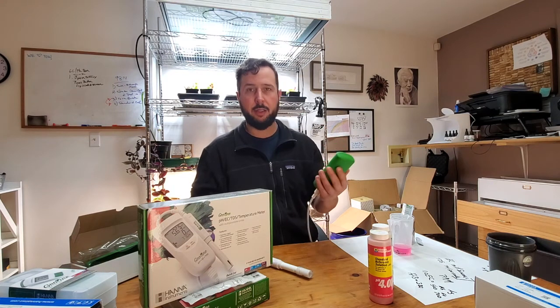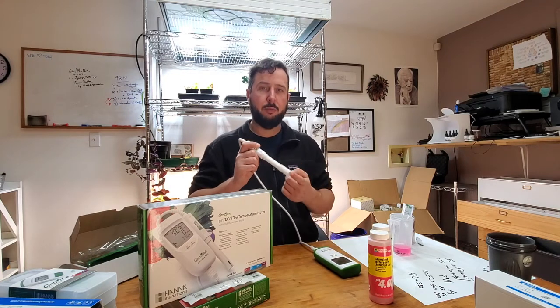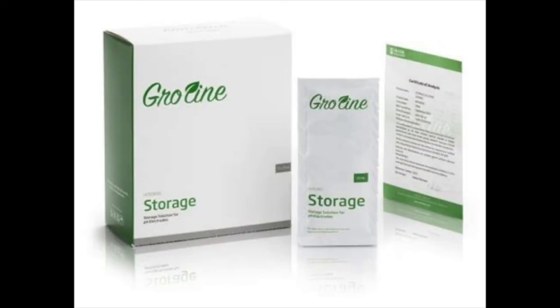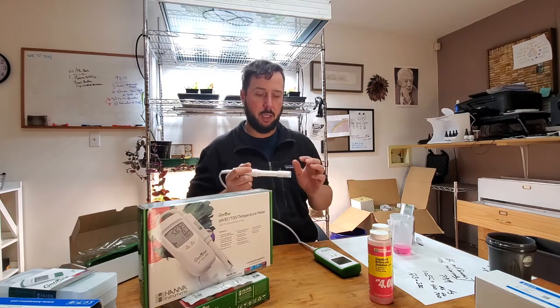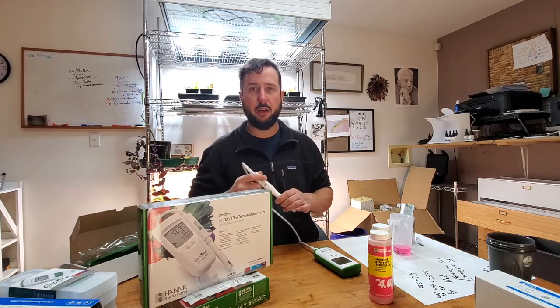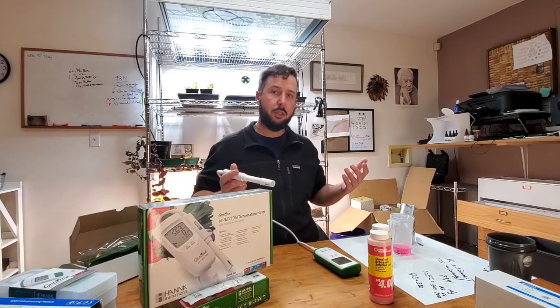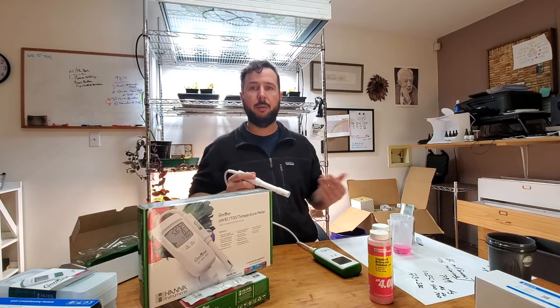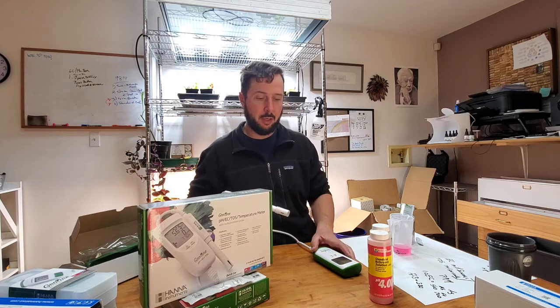The little thing is bomber — I've had this thing running for almost 6 months now and the battery is still registering 100%. Something to note: always store your probe in the proper solution. It comes in another one of these little packets — little sachets. It's just going to be better for your electronics if you do it, it's going to be more accurate for longer. They also have a cleaning solution which comes in another little packet — good to have on hand, or go get one maybe every 6 months or so. Clean the thing and make sure your calibrations are tight.